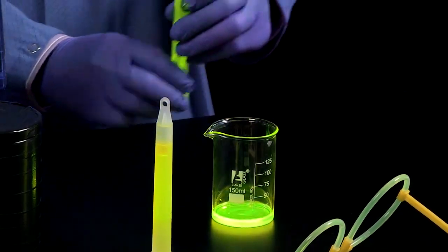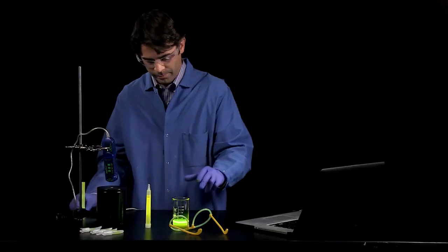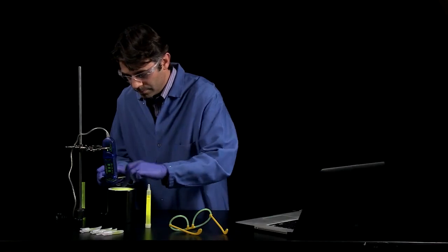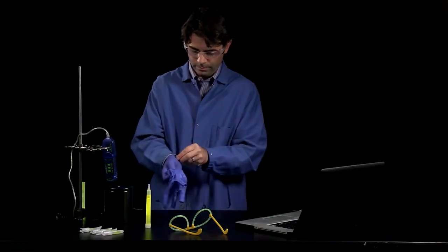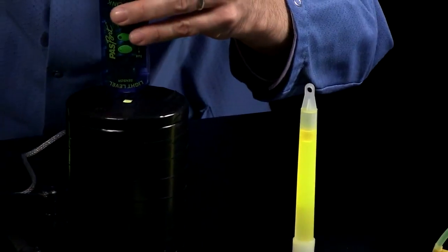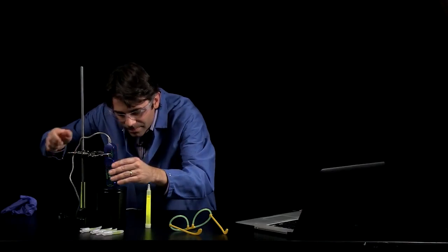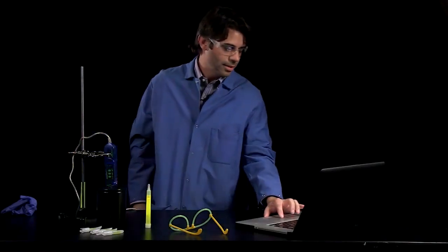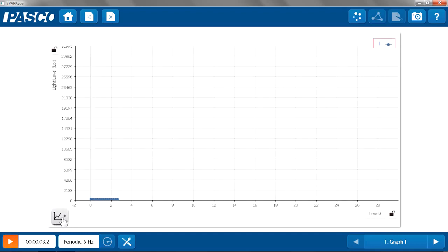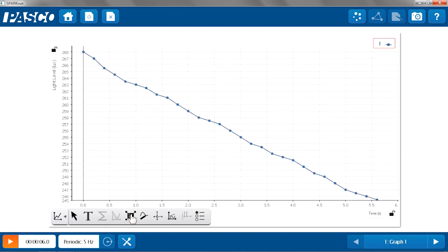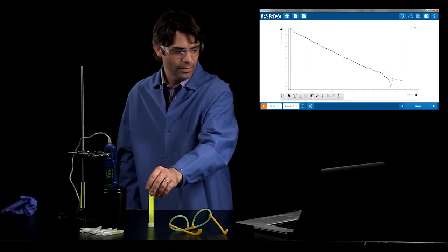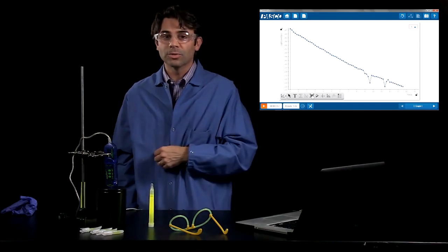Now I'm going to make sure they're nicely mixed and put them in my vessel. I'll line up my light sensor and start data collection. I'm going to auto-scale the graph. And you can see immediately, even though your eyes don't detect it, that the light level is decreasing over time.